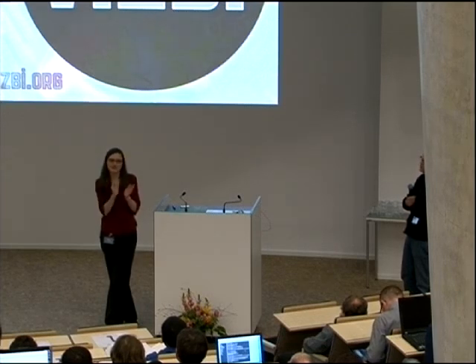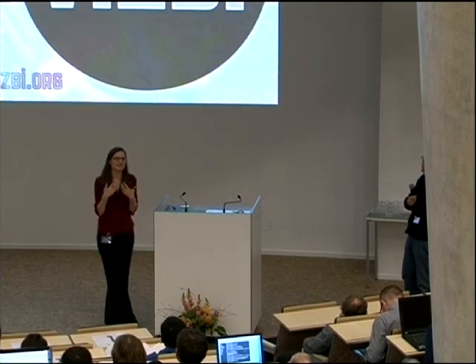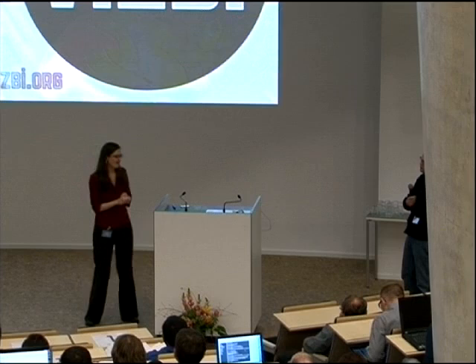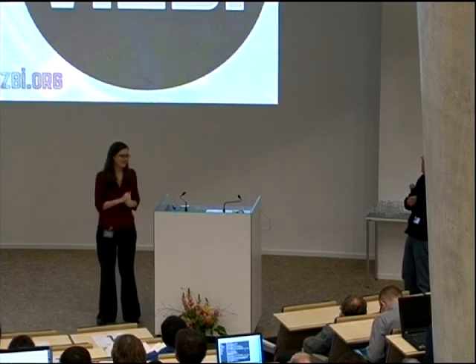It tries to learn where that threshold is from examples, but typically we as biologists are not that consistent about where we place thresholds in our mind, and so it's a bit of a complicated thing to approach. But in general I would say that the computer does as well as human beings, which is in some cases 85%. It's certainly not 99% consistency.